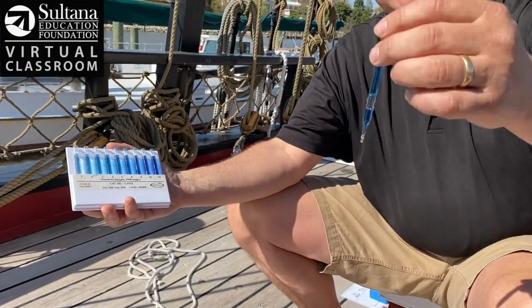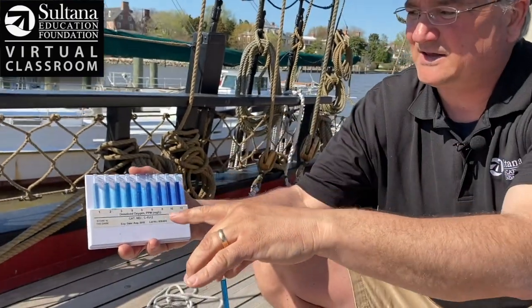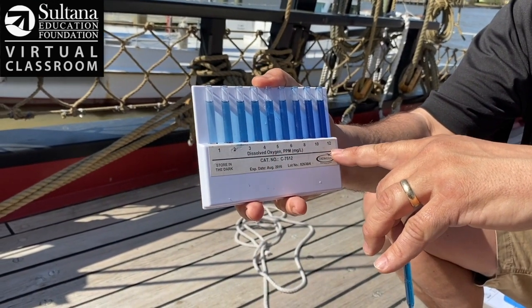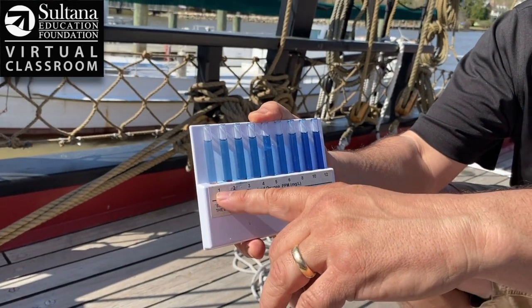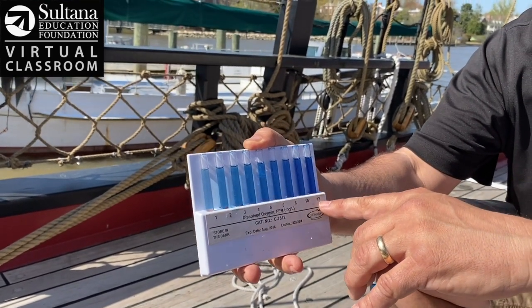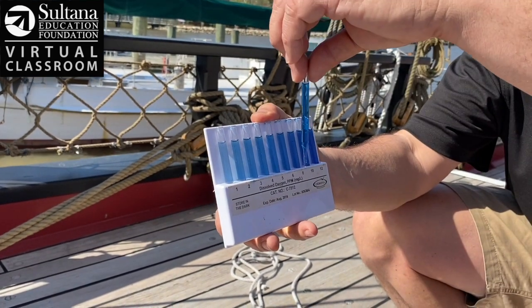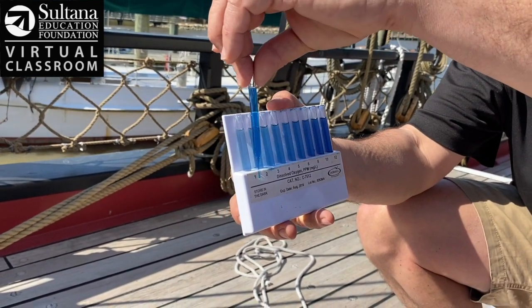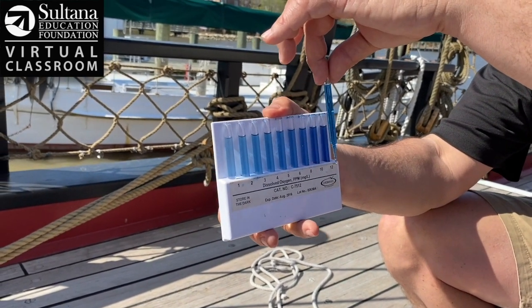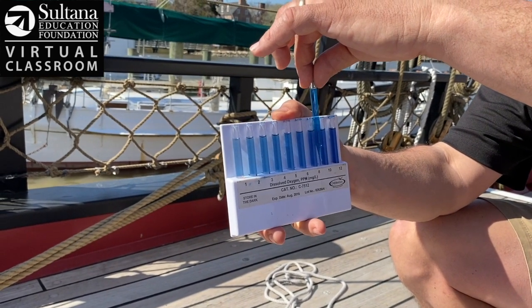The last step in my test — now that my sample has turned a shade of blue — is to take this device called a color comparator. You'll see these numbers along the bottom; these represent parts per million. One part per million on the left, 12 parts per million on the right, and all the readings in between. You can see each number has a different shade of blue above it. I take my water sample and match it up to the color closest to my sample. It looks to me like I'm right here between eight and ten parts per million — so let's call it nine parts per million.